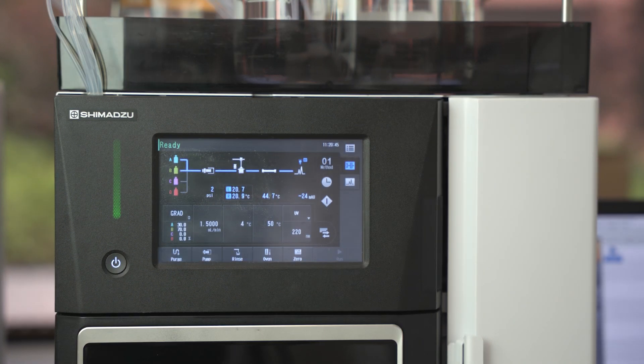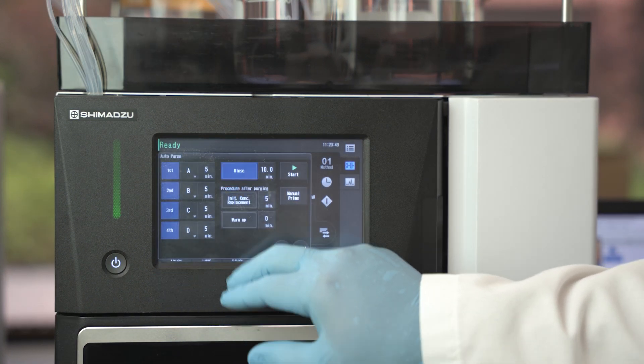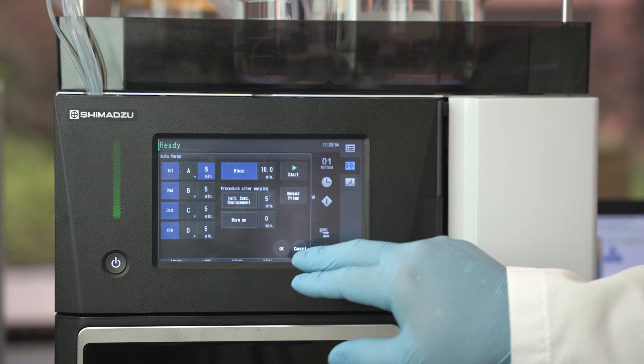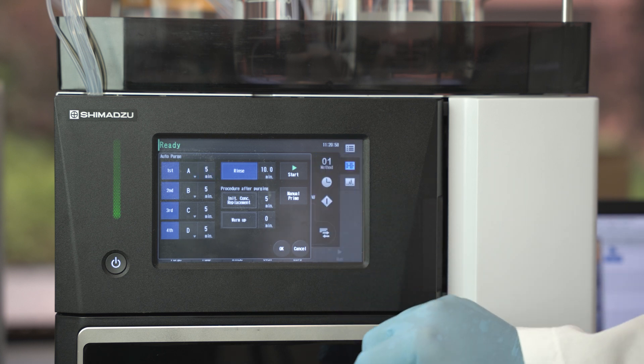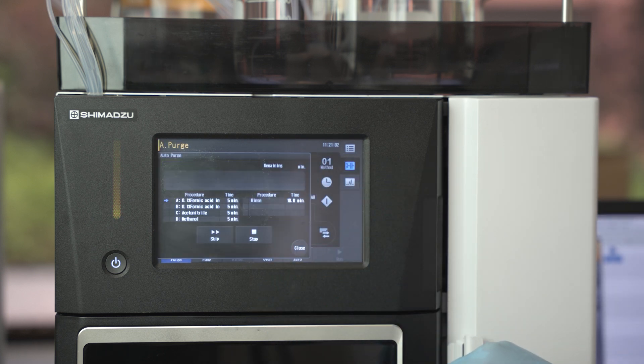After performing the manual prime, we can start an auto purge. Press the auto purge button and use the keypad to set the time to purge each solvent line A, B, C, and D for 5 minutes, and auto sampler rinse for 15 minutes. Press start to initiate the system's purge.